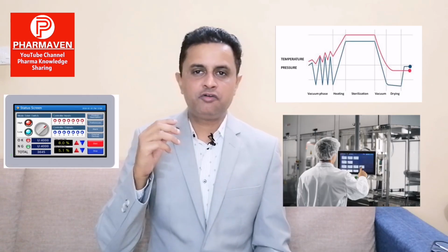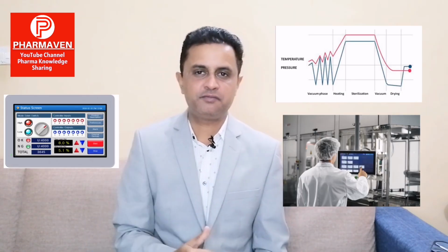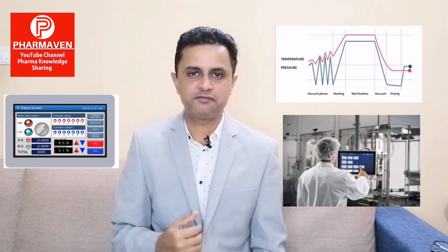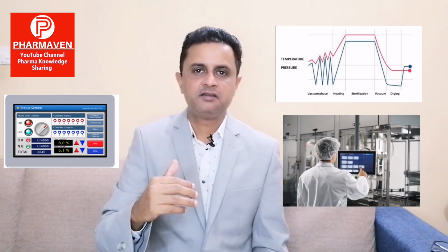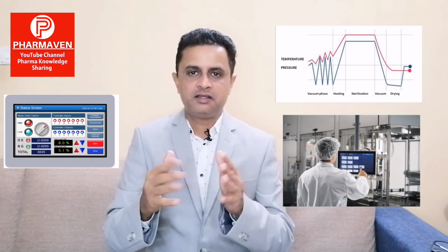Now the second part is cycle parameters. So when you have a BI failure, first is load arrangement, then also check the cycle parameters, and cycle parameter checking means in-depth evaluation. For example, take your cycle, just see how the vacuum pulses went, how the steam pulses went, how the sterilization hold was, were there any extensions in the vacuum pulse, where extra time was taken in achieving the same amount of vacuum.